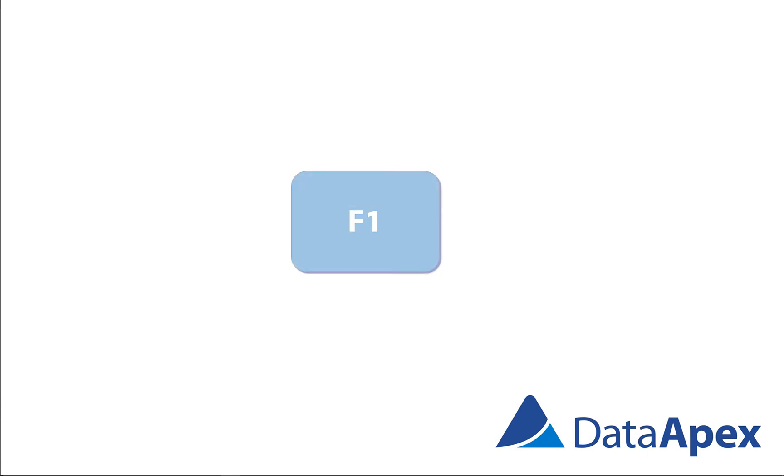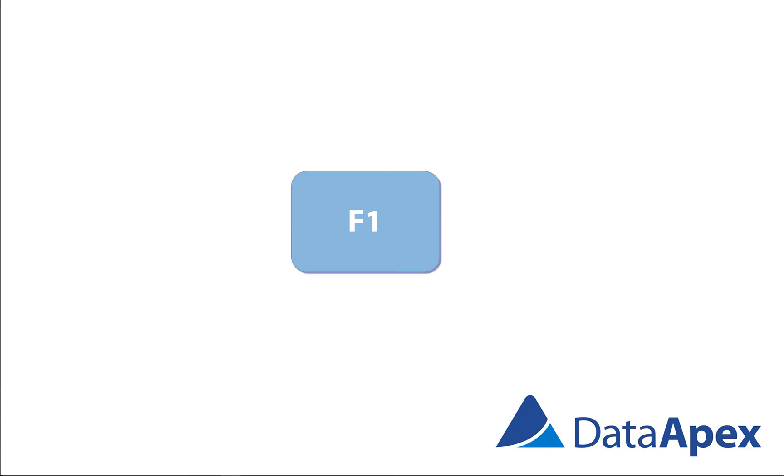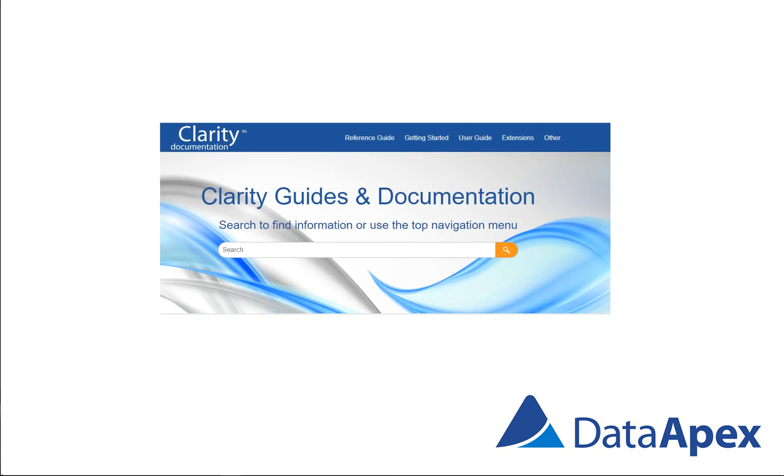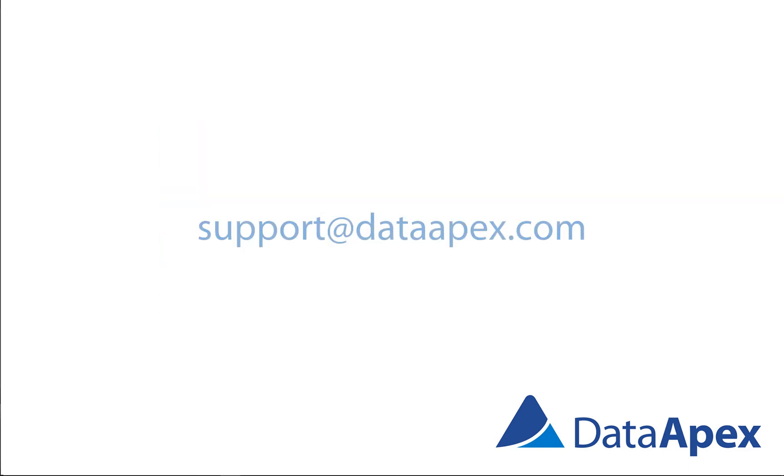For more details, please check the related tutorials. And if anything remains unclear, you can always press F1 to show help, go through multiple guides and documentation on dataapex.com or contact our support department.